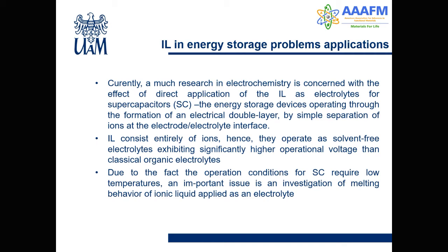Currently, much research in electrochemistry is concerned with the direct application of ionic liquids as electrolytes for supercapacitors. Ionic liquids consist entirely of ions, hence they operate as solvent-free electrolytes, exhibiting significantly higher operational voltage than classical organic electrolytes. Due to the fact that the operating conditions for supercapacitors require low temperature, an important issue is the investigation of the melting behavior of ionic liquids applied as an electrolyte.